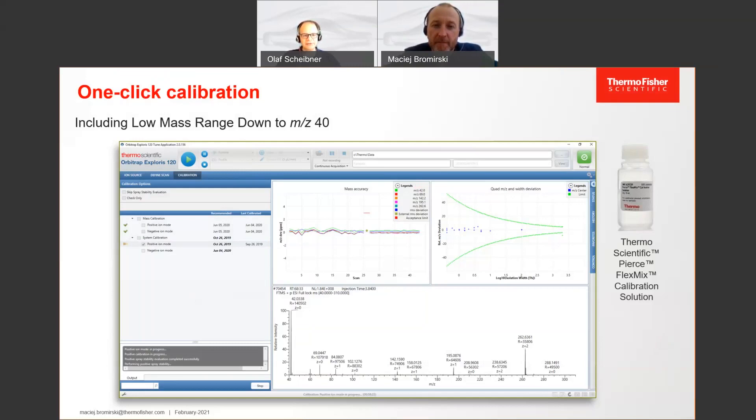The calibration routine runs fully automated and it's pretty smart nowadays. It doesn't run all the different items at the same time, because the full calibration can take a while. It will not run all items every time — it depends on how long ago the last calibration was run, and if the instrument has been vented in between. According to that, smart calibration will just activate the routines that are necessary to keep the instrument up and running at its best performance.